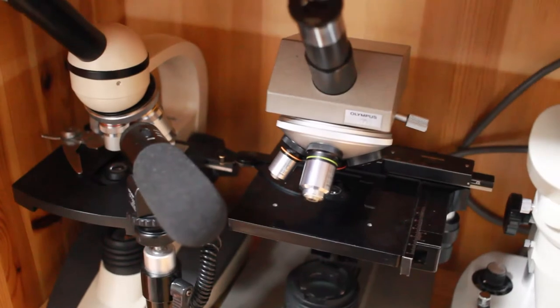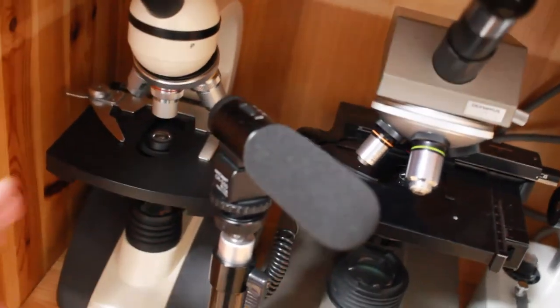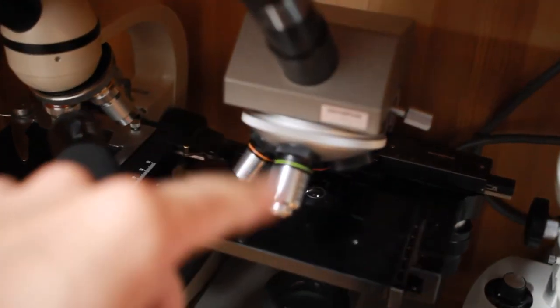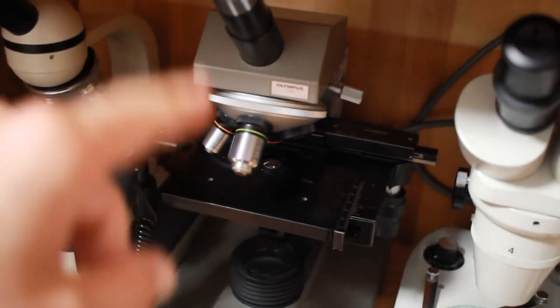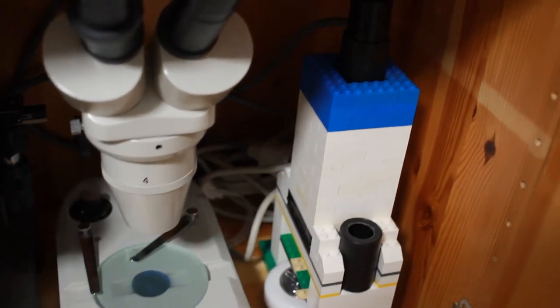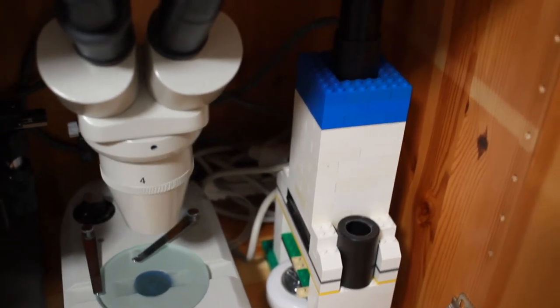I'm now going to show you a few of the microscopes that I have. You might have already seen some of them in my previous videos. I had to put the microphone here right now. It's a small educational microscope, an Olympus CHA microscope. It's maybe around 30 years old, but it's of very good quality. And this is a stereo microscope. And this is a Lego microscope. I call it the Elmo 2, the experimental Lego microscope.